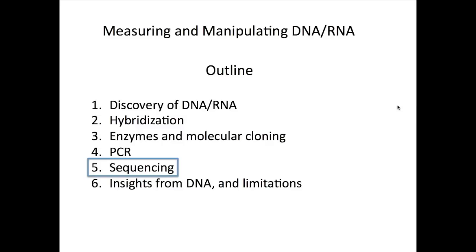Okay, now we move to the part that's getting to be something that's an area of huge interest nowadays, which is sequencing of nucleic acids.